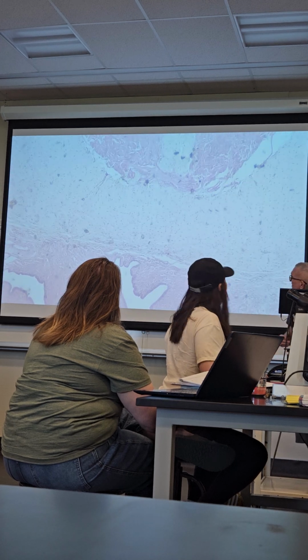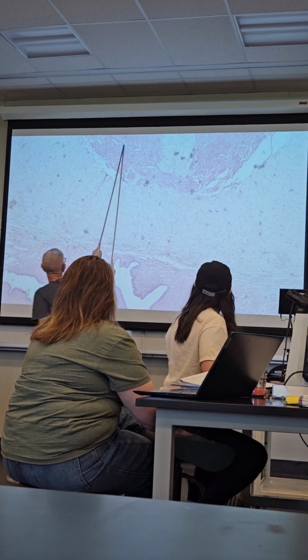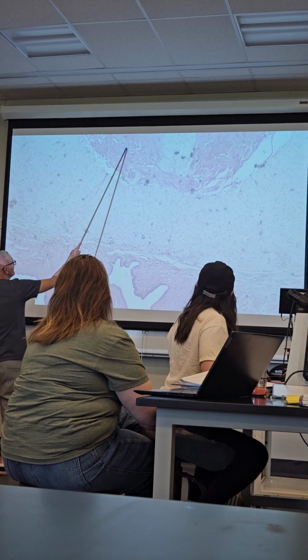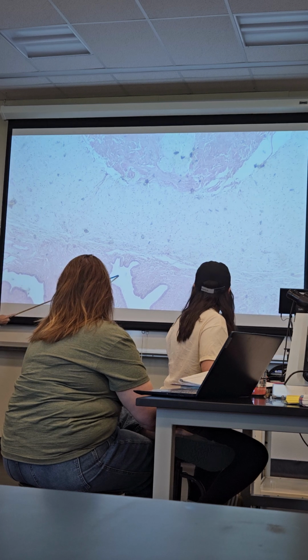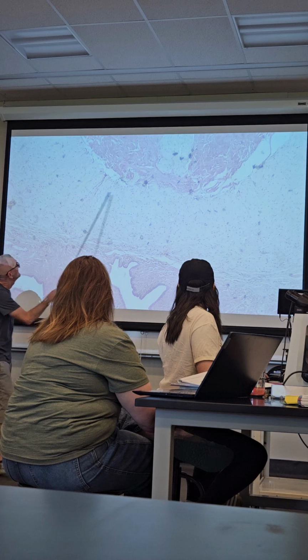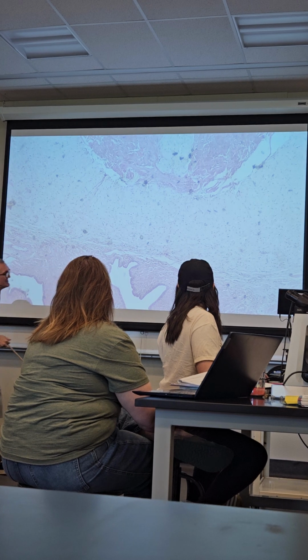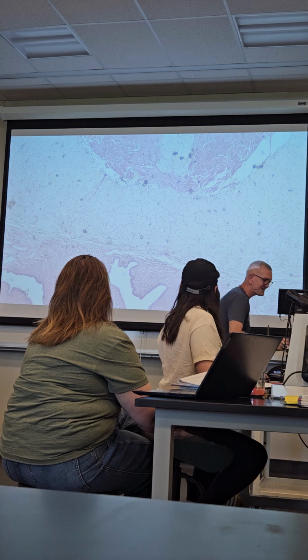What are we looking at? Yep. We got our corpora cavernosa, our corpus spongiosum, our urethra. That one's pretty straightforward. And that thick connective tissue collagen band, which you don't need to know, is a nice landmark.